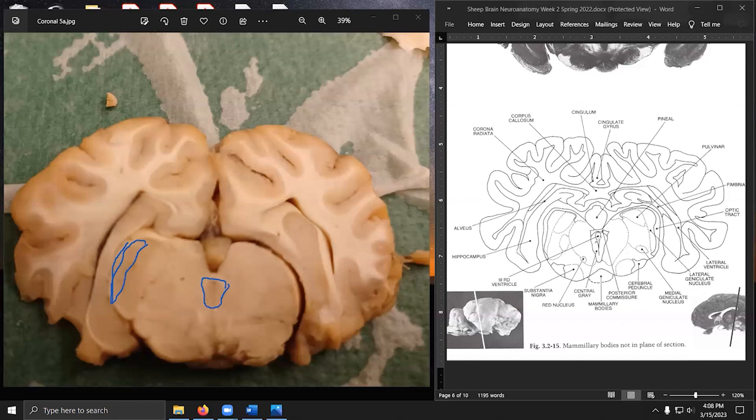That is the central gray, also known as the periaqueductal gray matter, or PAG for short, P-A-G. The periaqueductal gray matter surrounds the aqueduct. It does appear a little bit before the cerebral aqueduct, but still it is a very large brain region that we're going to see in the successive pages as we flip forward. All right.